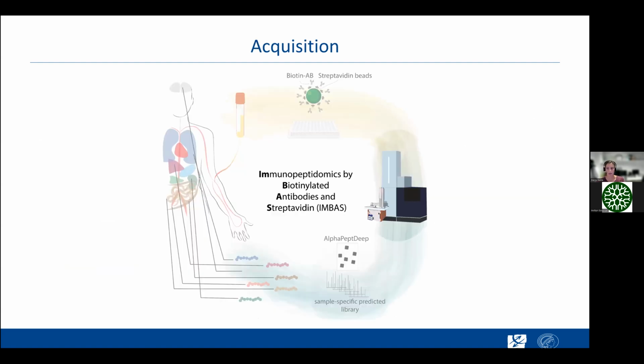So next step is really the acquisition. And I want to spend a few minutes on how I decided to use those methods and also on the mass spectrometer I used here, because those steps are really important to take into consideration when designing and performing those experiments, especially if we later on want to apply it to a lot of samples or maybe only a few samples. So a lot of consideration goes into what kind of gradient and what kind of method you use.